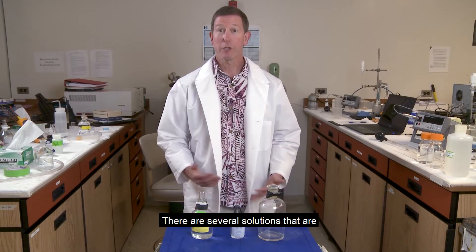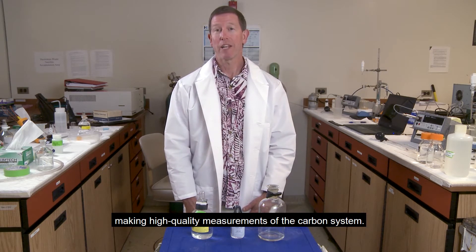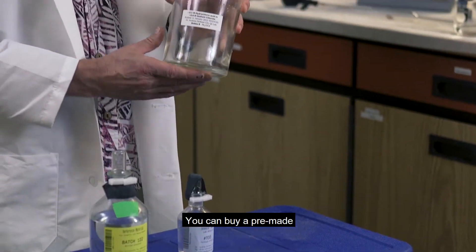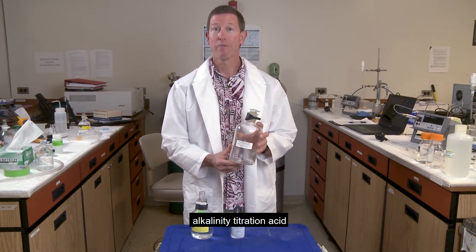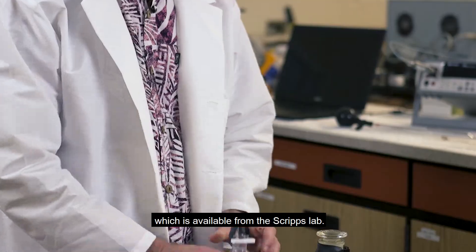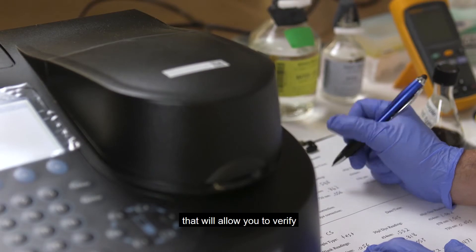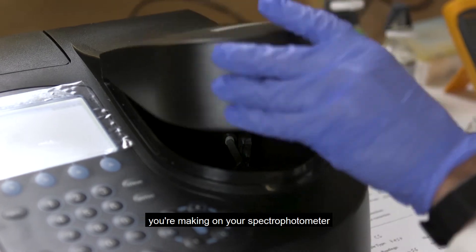There are several solutions available from Andrew Dixon's lab at Scripps that are important for making high quality measurements of the carbon system. You can buy premade alkalinity titration acid, which is available from the Scripps lab. You can also buy Tris buffer, which has a certified pH that will allow you to verify that the measurements you're making on your spectrophotometer are correct.